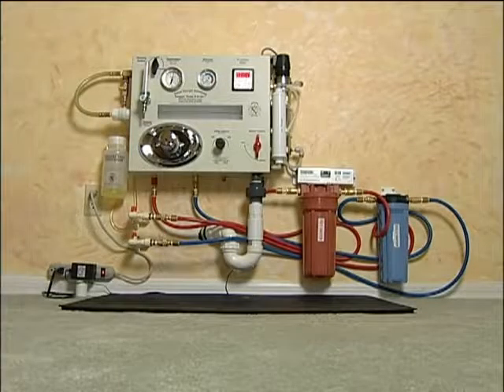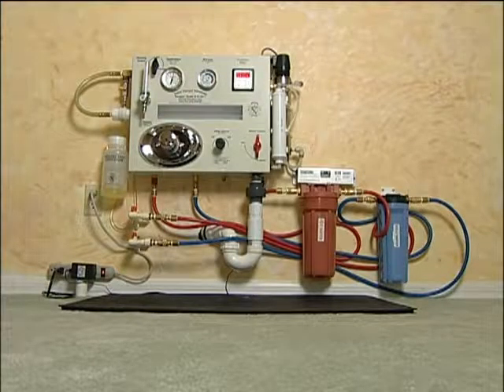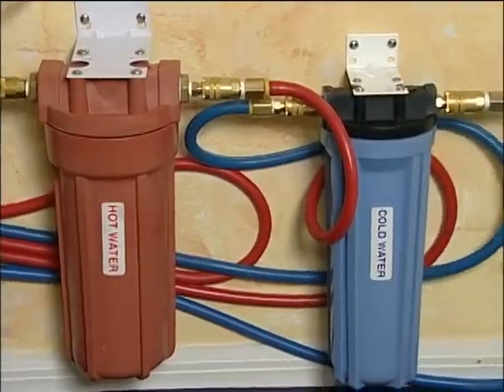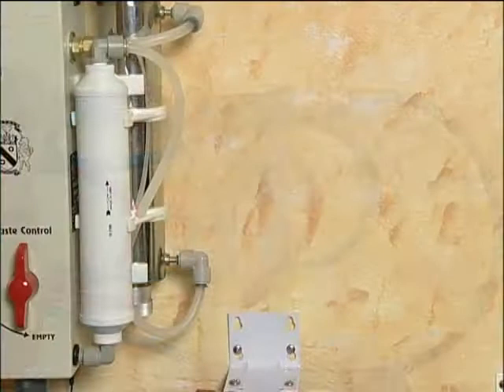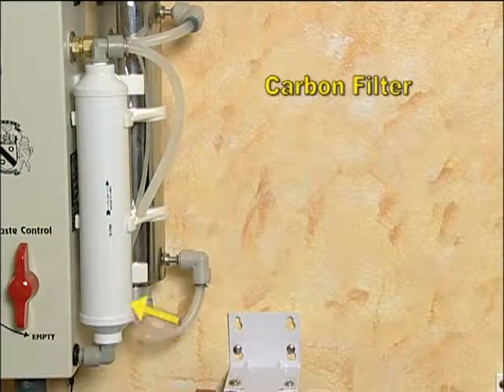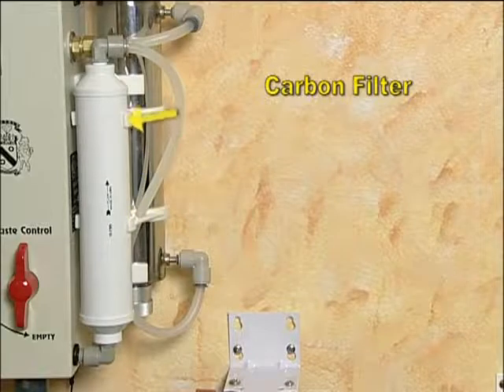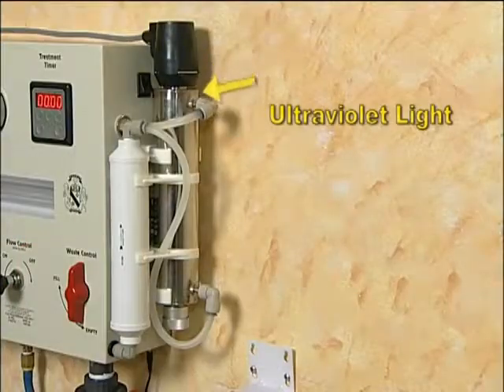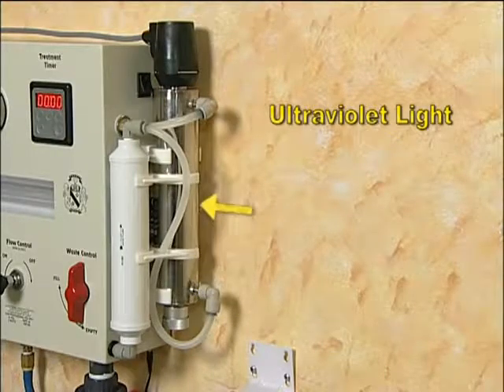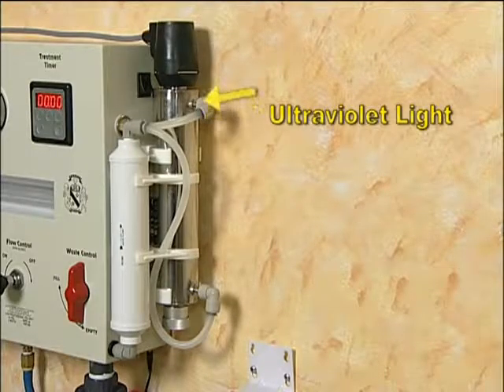Now that your instrument is installed, let's take a look at its components. This is the particle filtering system — one is included for both the hot and cold water. This carbon filter, attached on the side of the instrument, will remove chlorine. The ultraviolet light will destroy 99.9% of all bacteria and viruses that may be present, and will remove certain parasites such as Giardia and Cryptosporidium.